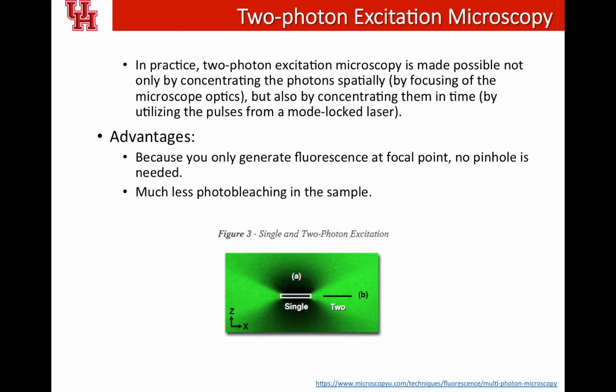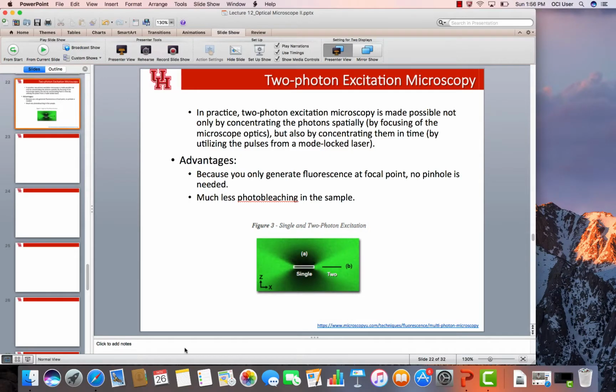So that's about the class we're going to cover. Next we will introduce some super-resolution fluorescence microscopy, and maybe Raman and infrared absorption based methods, depending on the time available.